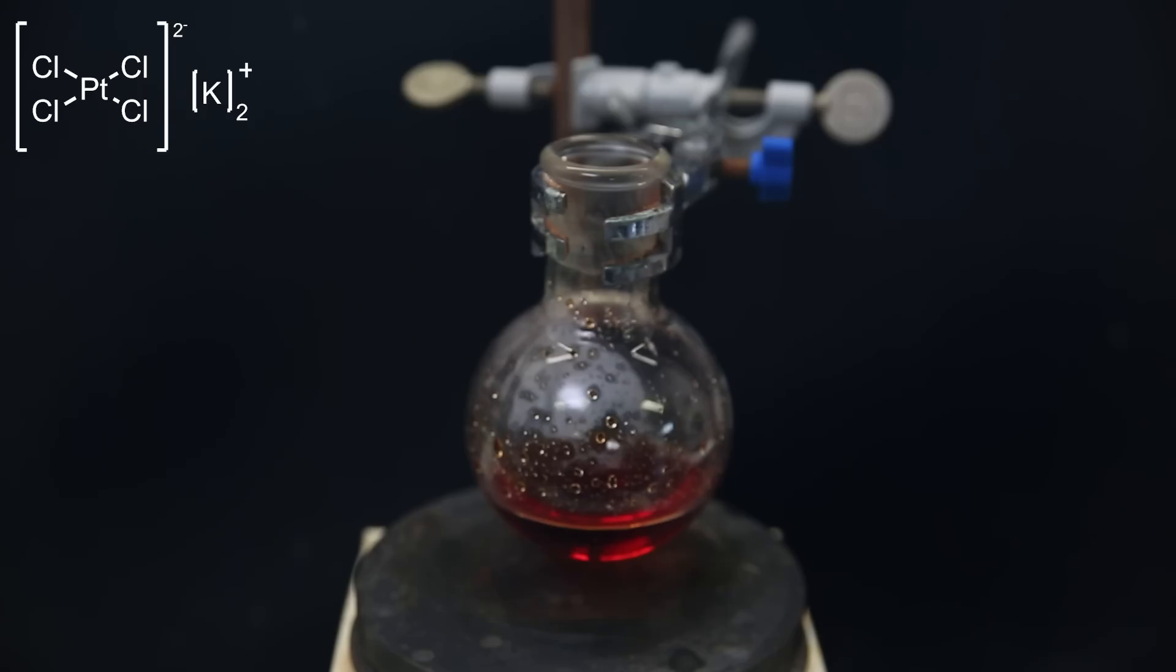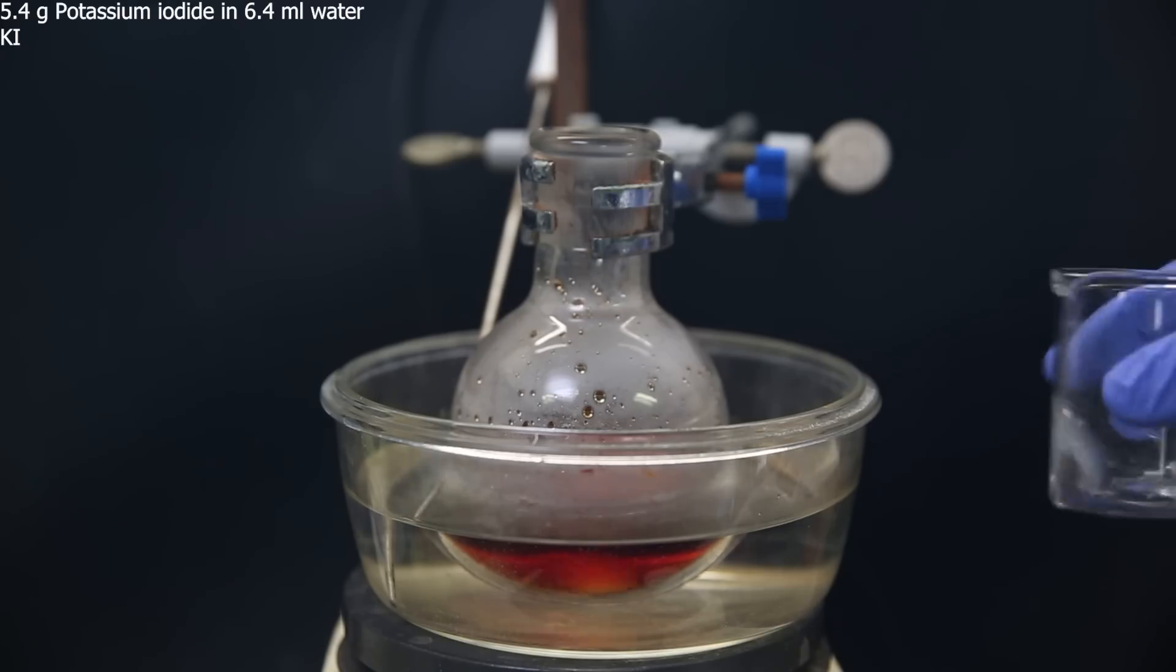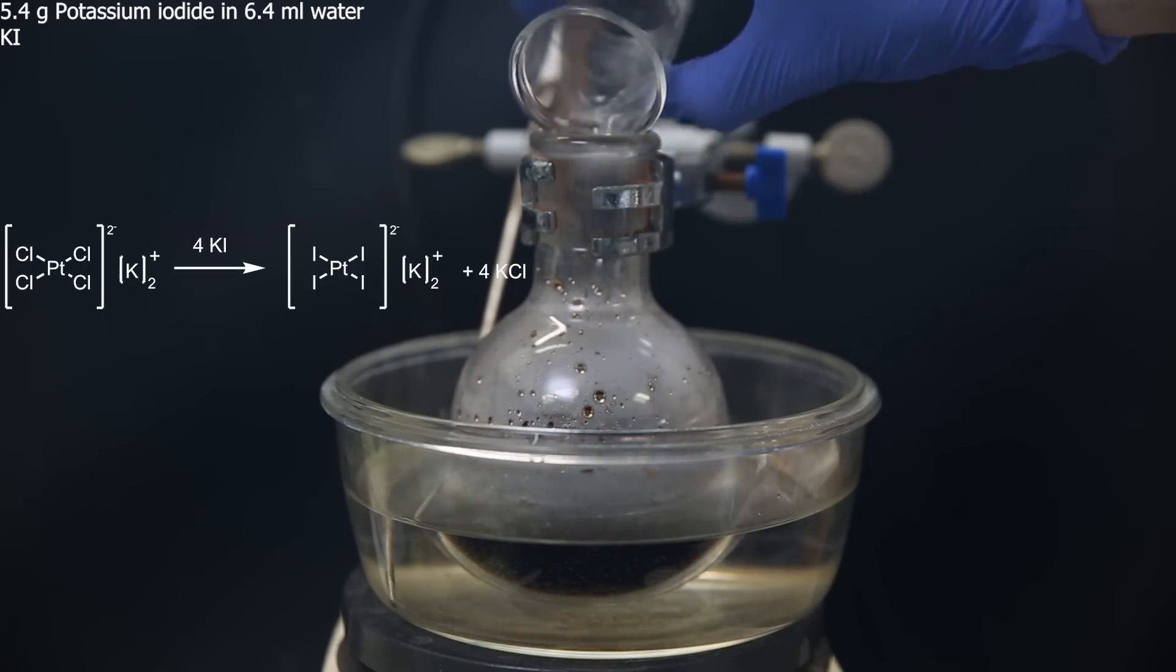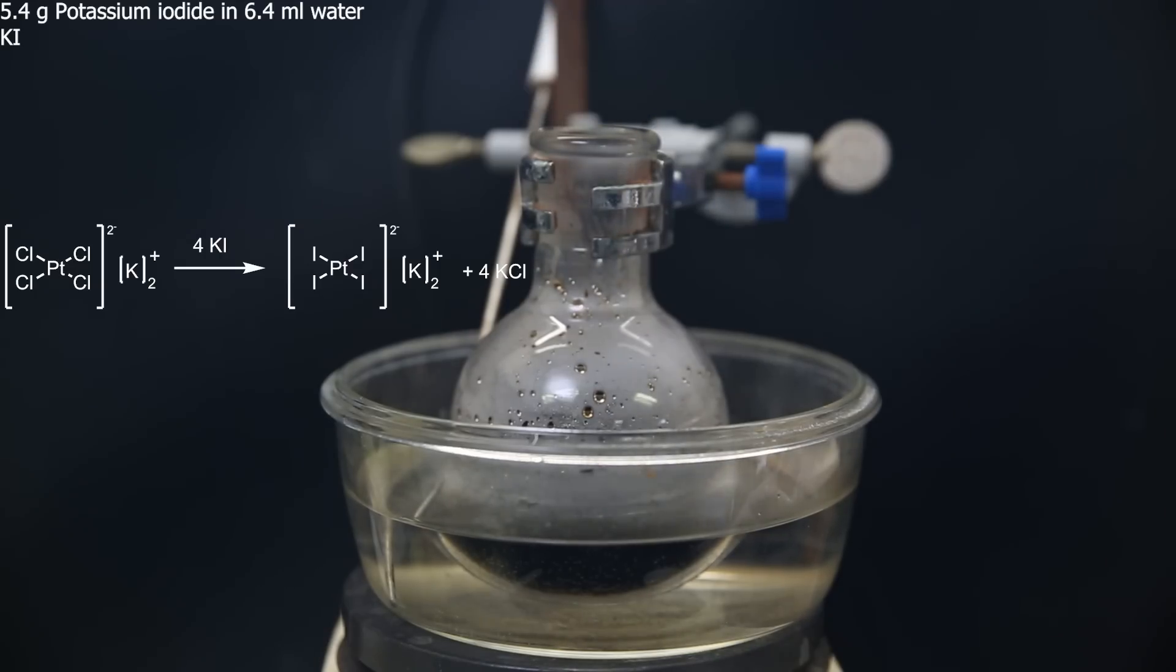Now for the next reaction, I set this flask in a water bath and heat it to 40C. I add a solution of 5.4 grams of potassium iodide in 6.4 mils of water. It immediately replaces all of the chlorines with iodines, and it turns black from the formation of the tetraiodoplatinate ion.